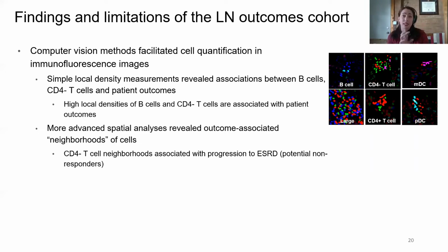Once we realized that we had outcomes for this and could do these interesting analyses, we said we need to be taking whole slide images. Later on, I'll talk about moving to data sets like that and how much more powerful it is as opposed to these discrete ROIs. But it was nice that the discrete ROIs had that built-in proxy for density. It made those calculations really easy.